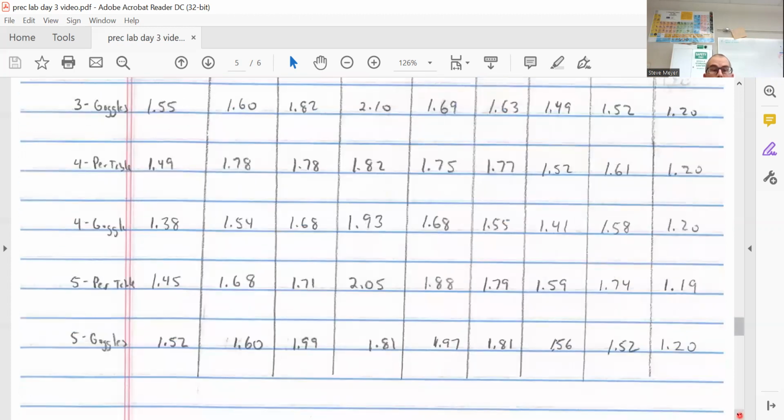And I think it's probably fair to say, if I drew this in here quick, I could draw a 1 here. This would be, oops, maybe I can't draw that in there. I'll call this one 1 right here. And we'll skip a little bit here. This would be number 2. Skip a little bit here. This would be number 3. Skip a little bit here. This would be number 4. And we'll just come over here and do 5 right here.